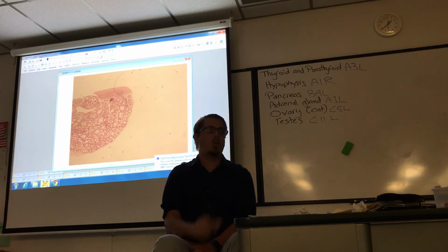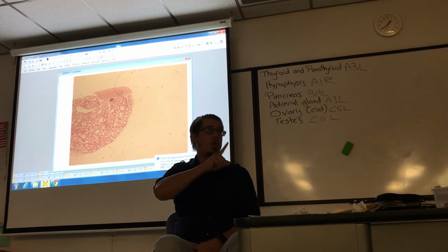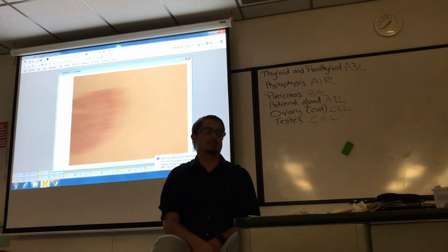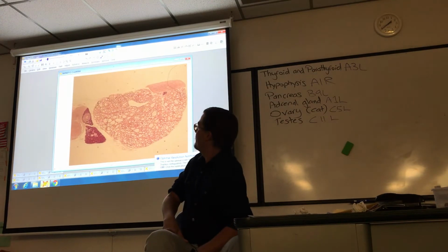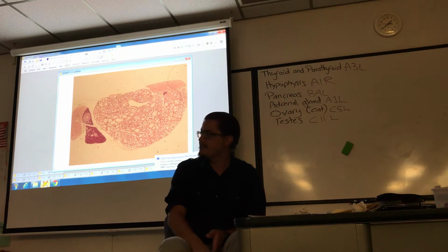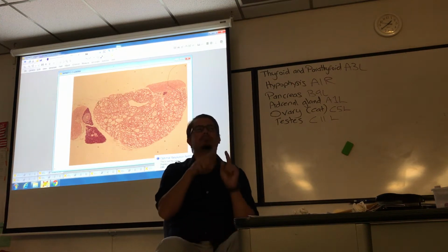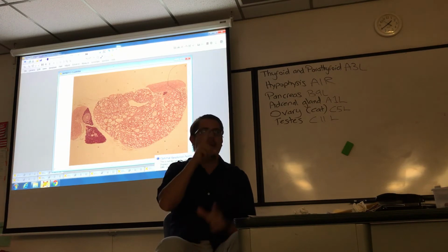Let's go low, medium, high. Okay, let's go with that. Low is actually 40x magnification. This is what you see. Allow me to make one logistical move. I got to get my mouse by the scope so I can take pictures.